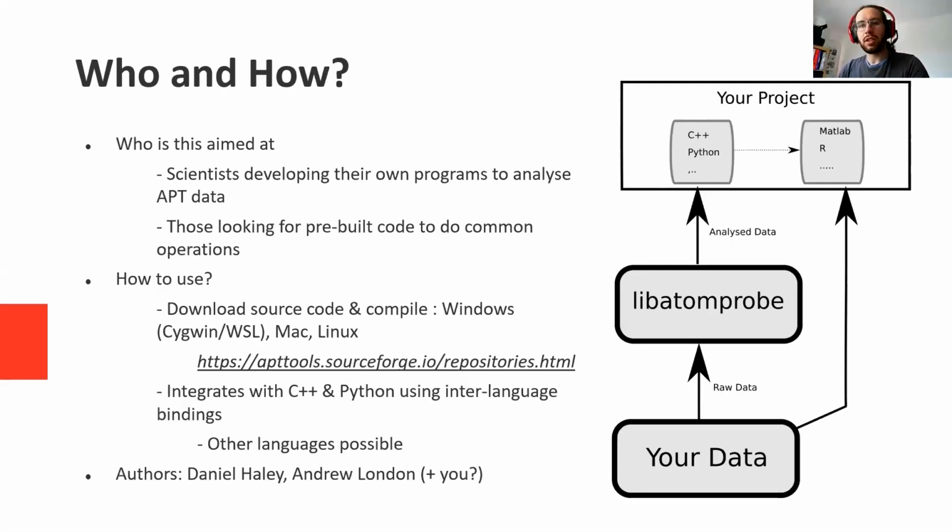So the idea is that this is aimed at people with more coding knowledge than just, say, the average PC user, but a lot of scientists develop their own code, and we're looking to take away some of the tedium and the difficulty in reinventing the wheel that happens when people re-implement common functions. For example, anyone who's written a RRNG range file reader will know the headaches that you can have. So we've got code in a standard library that you can use.